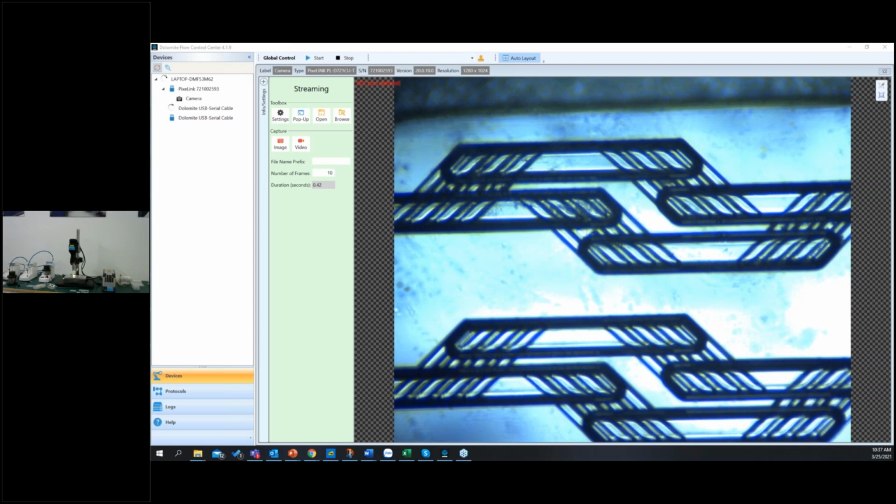Okay, I found one question, from Sikant Saram. What's the maximum mixing efficiency that can be obtained using a microfluidic chip?